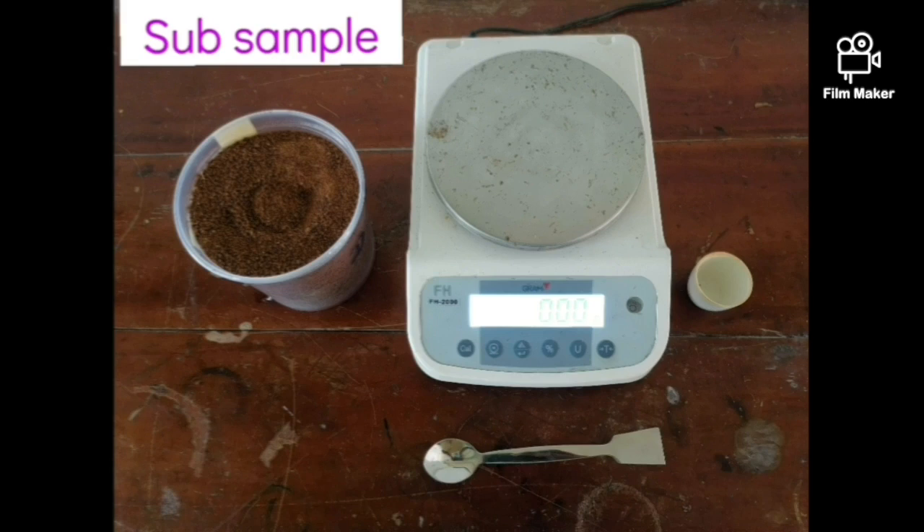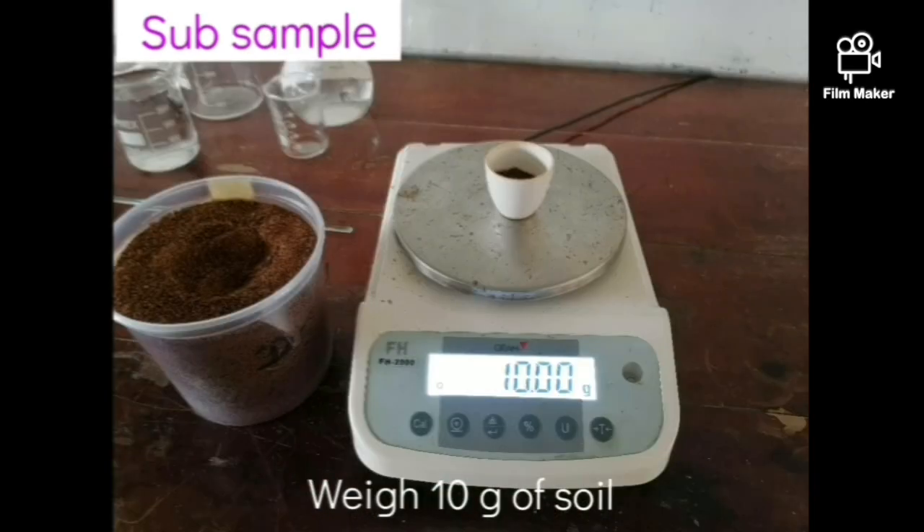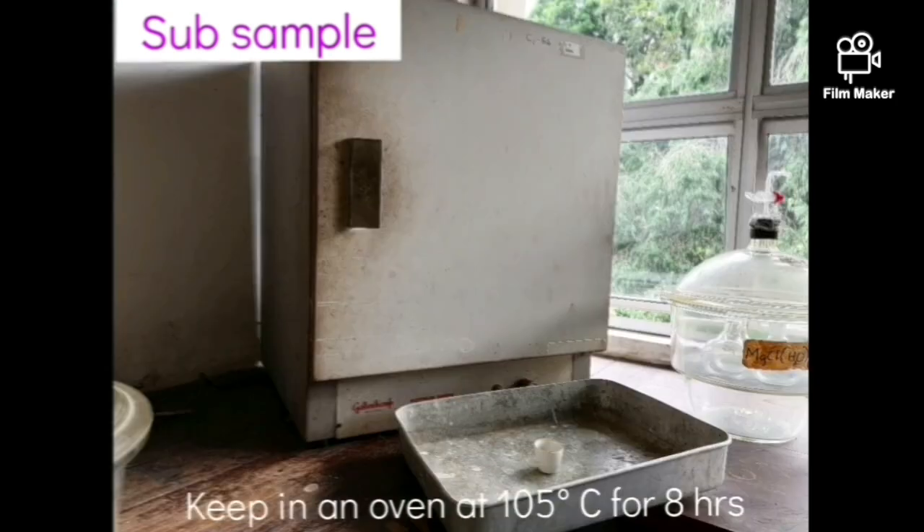To find the dry weight of the soil sample, we have to know the moisture content. Therefore, we use a subsample. Weigh 10 grams of the same soil sample and determine the gravimetric water content by oven drying it at 105 degrees Celsius.